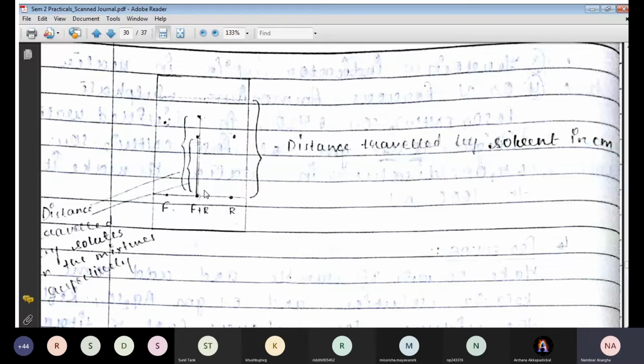So as soon as the fluorescence goes up, fluorescence in the mixture will also go up. At the same distance, it will cover the same height. I am talking about height. It will cover the same height that we see in the fluorescence standard; the same height will be covered by the fluorescence in the mixture. Right? Am I clear to you?